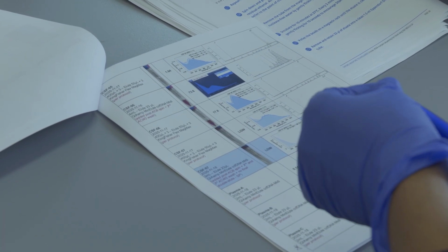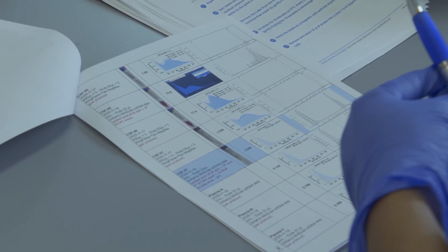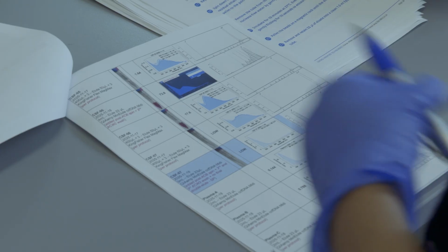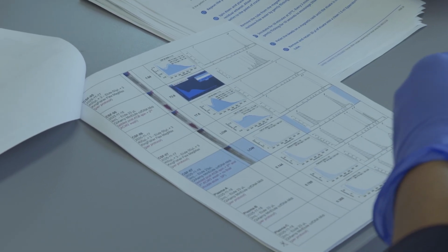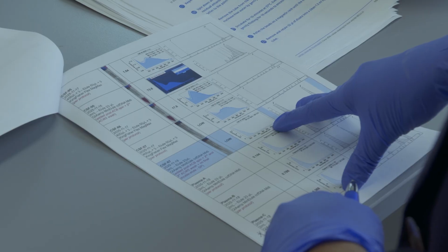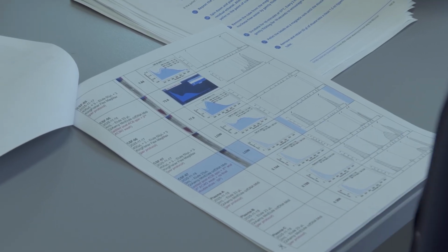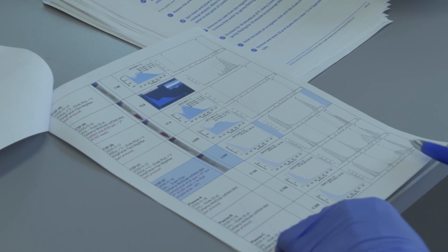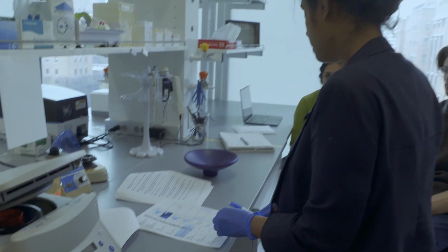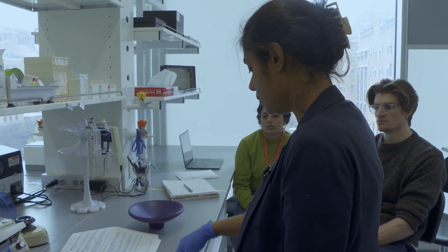Because once again, this is a pilot. Based on the QC, I don't think we should expect really high quality data output here because of the presence of gDNA. The data would be compromised because it will have some coverage, right?